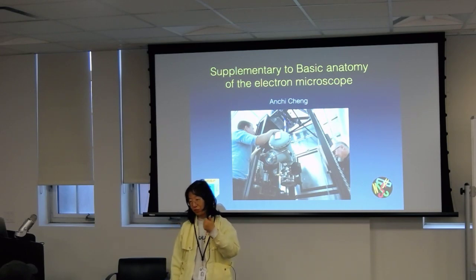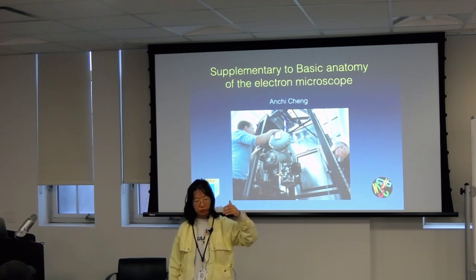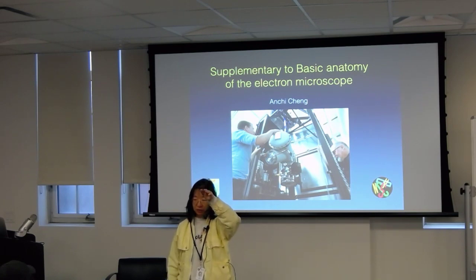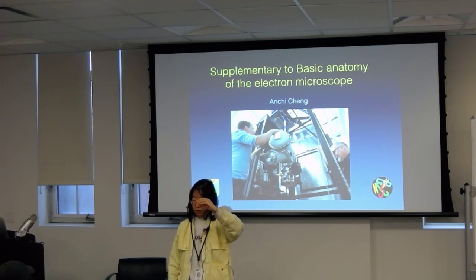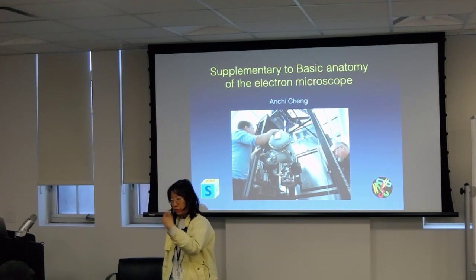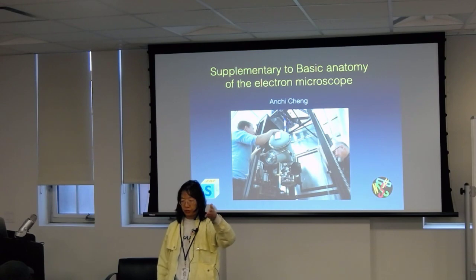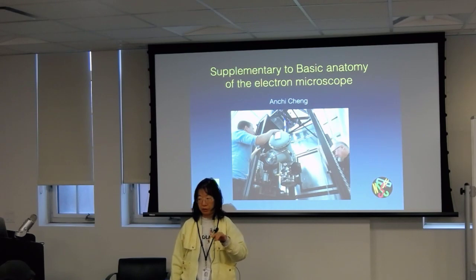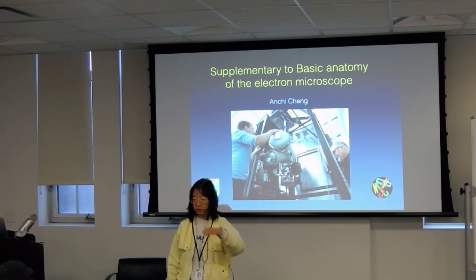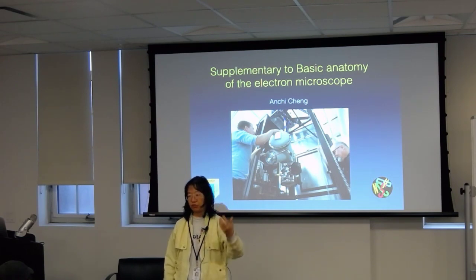Okay. Now, the first thing is for you to actually go look at those lectures. There are 4 things in there. There's always the deflector, because the source doesn't always come in straight. There's the lens part, and the lens will be made with coils, to create the magnetic field to focus those electrons. And then you'll have a stigmator. The stigmator underneath that is required because you can never make a perfect lens.